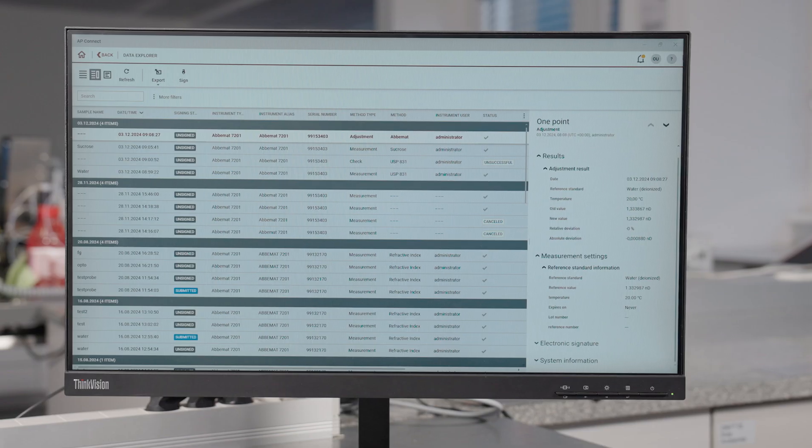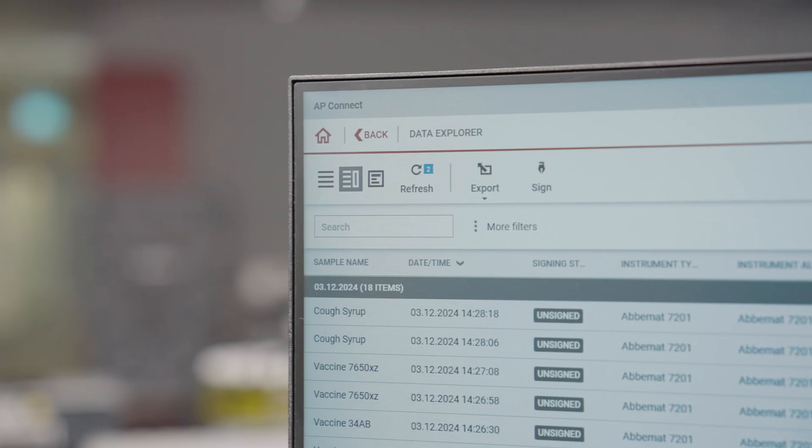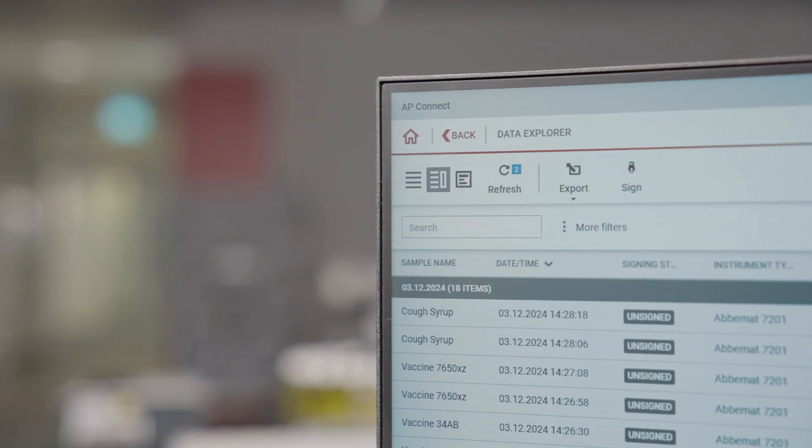Anton Parr's AP-Connect software enables centralized, secure data management across multiple devices.